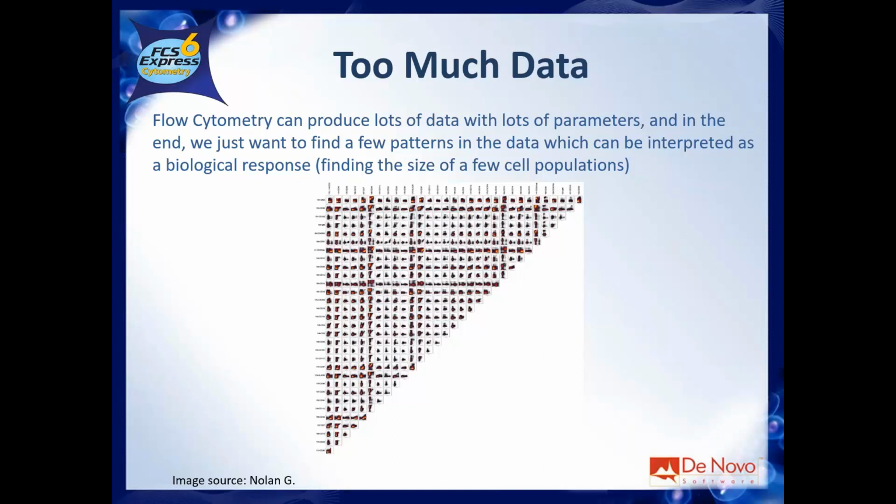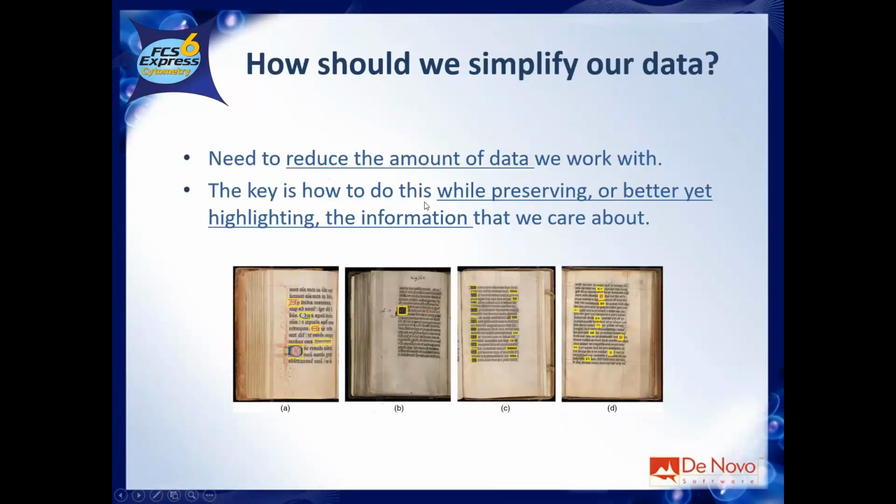This is, first of all, time consuming, but also not really useful because it's anyway a limited approach, because you will always look at two dimensions at a time. So you will never have a very comprehensive view of what's inside your tube.